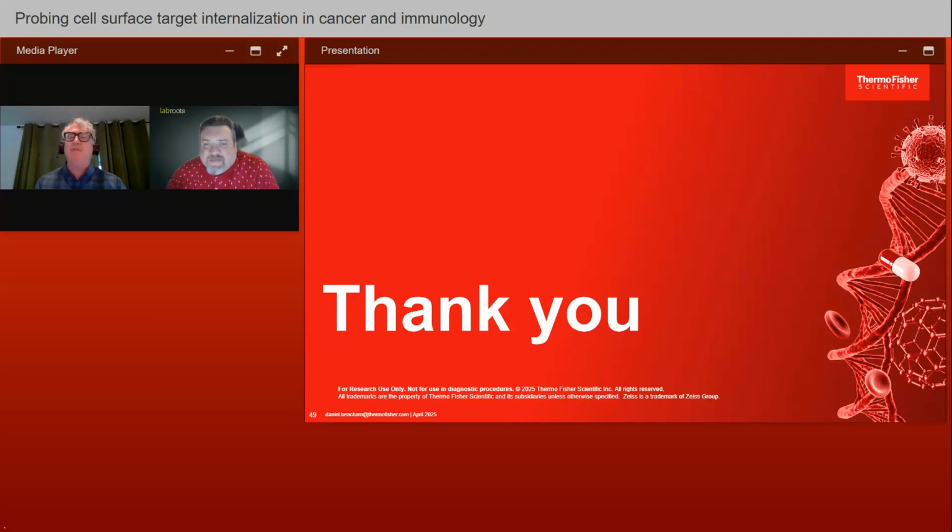I show some examples, either using a drug to inhibit the cathepsin, which gives us a window into the specificity of the enzyme for its substrate in that compartment. I showed how you can compete with binding with unlabeled antibody and displace the binding of your label and prove that it's no longer engaging the target. And in fact, I showed a dose dependent curve of that. And if you see more than one notch in the rising phase of that slope, you can also identify additional binding events that are being displaced there.